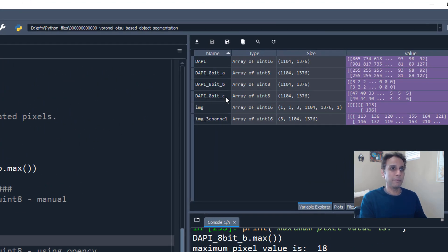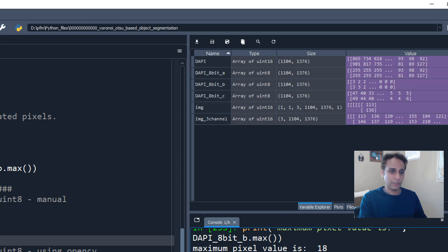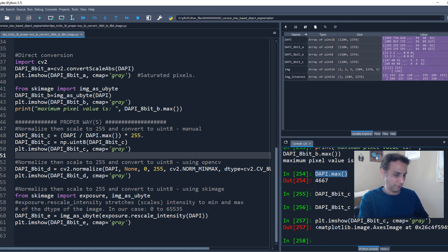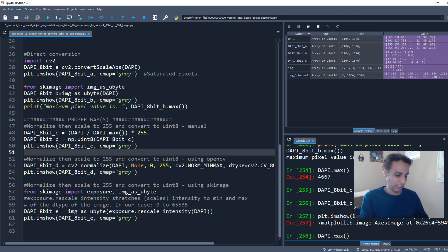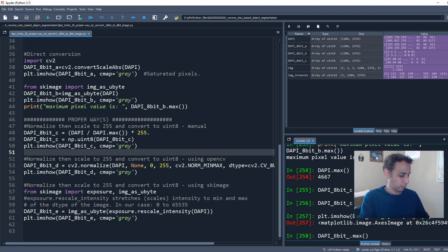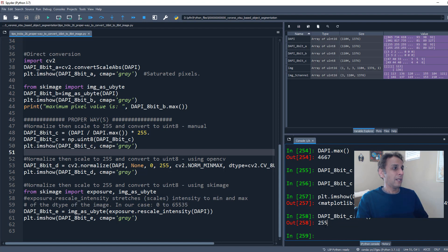what is this, DAPI_8bit_C, are reasonable. They are going from 0. In fact, they'll go from 0 to 255. So let's go ahead and this is DAPI, sorry, let's do this, DAPI_8bit_C. So 0 to 255 right there. Sorry, yeah, right there for 8-bit.